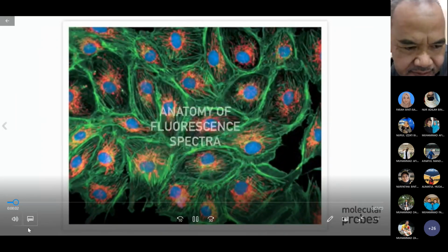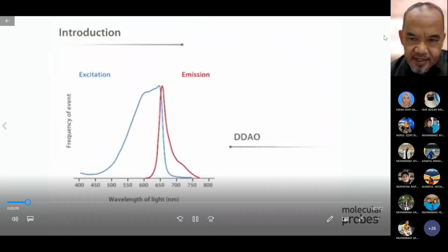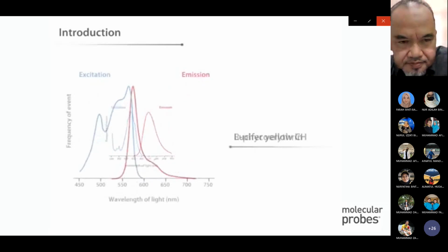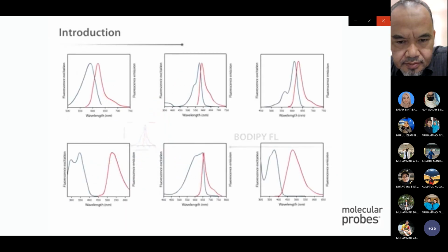Is it okay now? The basic fluorescence properties of a fluorophore, excitation and emission, are often presented in the form of line graphs. These curves describe the likelihood that excitation and emission will occur as a function of wavelength and provide important information about the expected behavior of the irradiated fluorophore. Understanding the information is an important step in understanding the phenomenon of fluorescence.